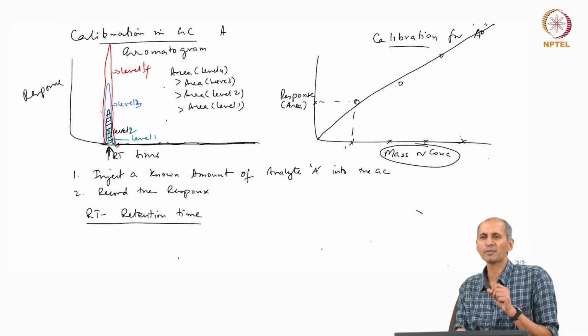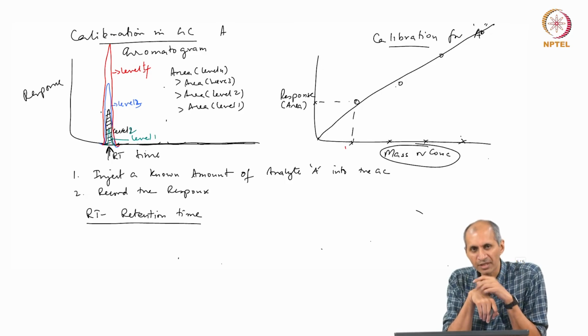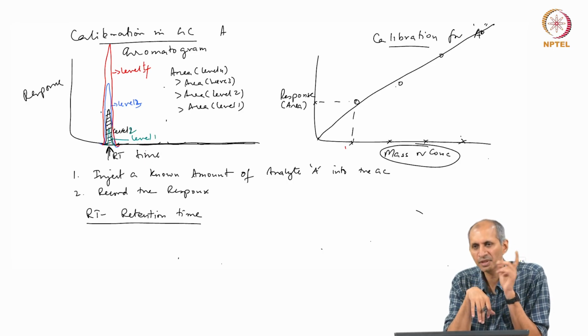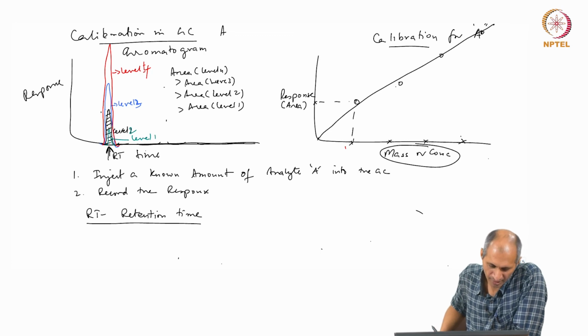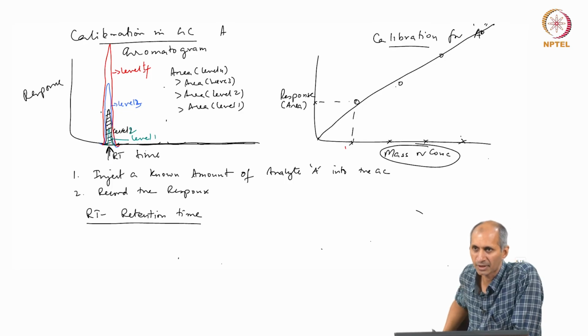The retention time is a very important characteristic of an analyte for a given system. So, you have to understand that the retention time will change if I change temperature, if I change the properties of my mobile phase, if I change column. So, if I know this system, if I say I am introducing a sample and a peak comes at retention time of say 2 minutes or 3 minutes, I know with a certain amount of confidence that it is this particular compound. That is one characteristic of the particular analyte arriving at a particular time. So, the retention time is characteristic of this.